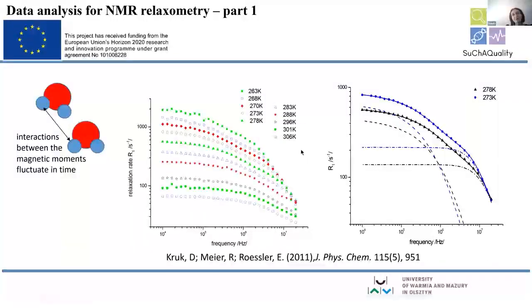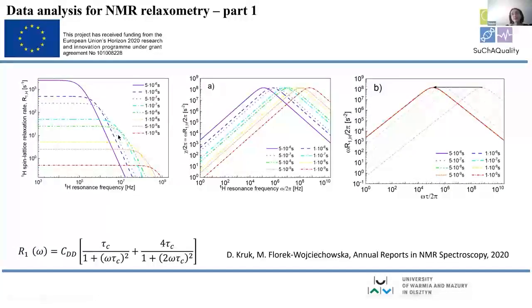If you look here, for instance, here is high temperature, whatever it is. And for some part, the curve is quite flat. At lower temperature, let's say one can say that up to this point is more or less flat. At lower temperature, definitely it's not, because the dynamics became slower. So this is something to think about.